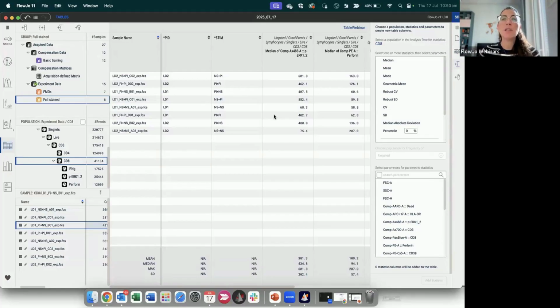In terms of geometric mean, it really depends how coherent, I would say, are your values. So if you keep having the same values over and over and it's really reproducible and you don't have any difference, then you can either use geometric mean or mean, that's fine.